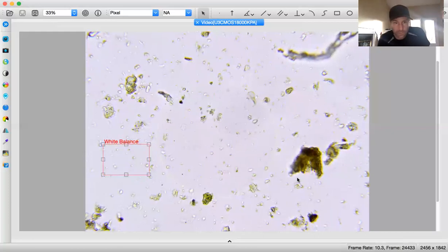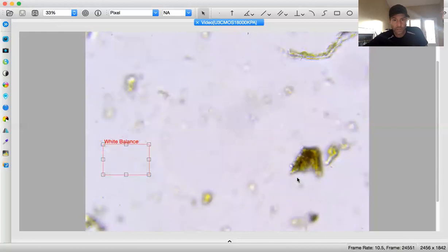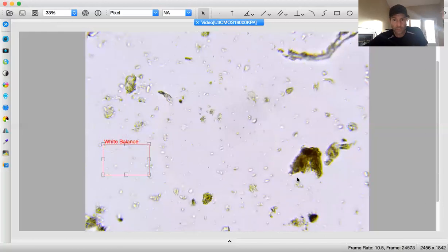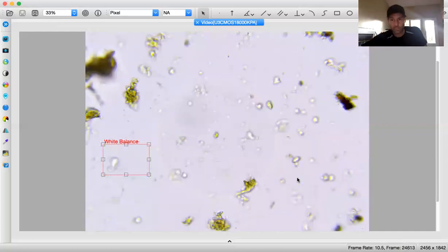And I don't see fungi, so no other filaments. So we will be moving on here as well. And again, just go to the top of the frame and down just to make sure. Yes, sir, I don't see it. So moving on, number 5 here.